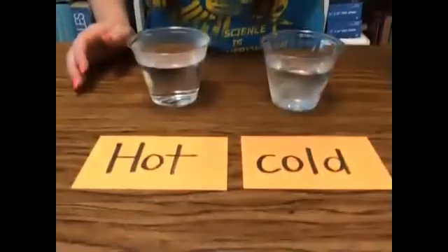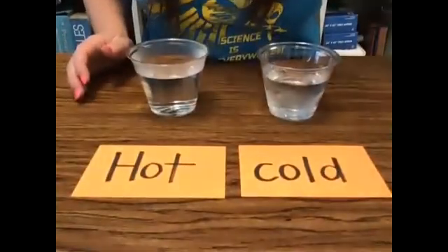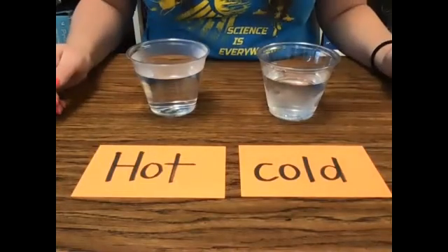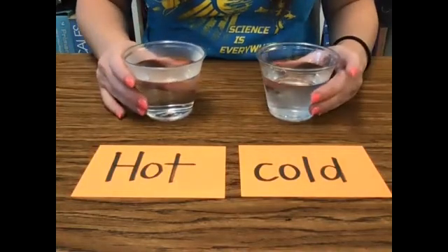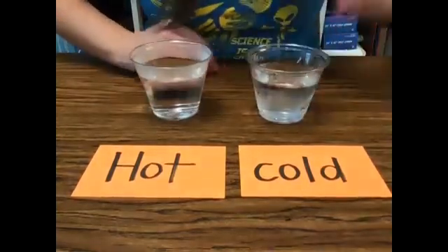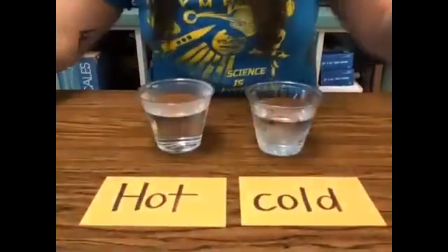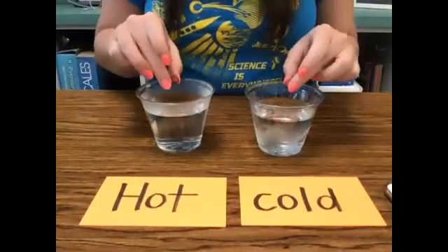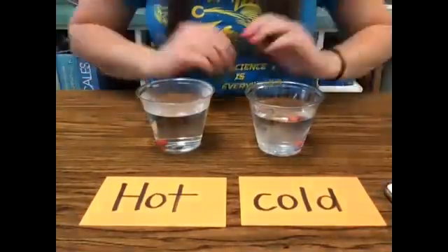All right. So please make sure you are watching. Please make sure you are paying attention, because remember, at the end of this, you are going to be writing 3 sentences about what you observe and what you notice. Also, my goggles are still on. All right, here we go. I am going to drop them in and start my timer.